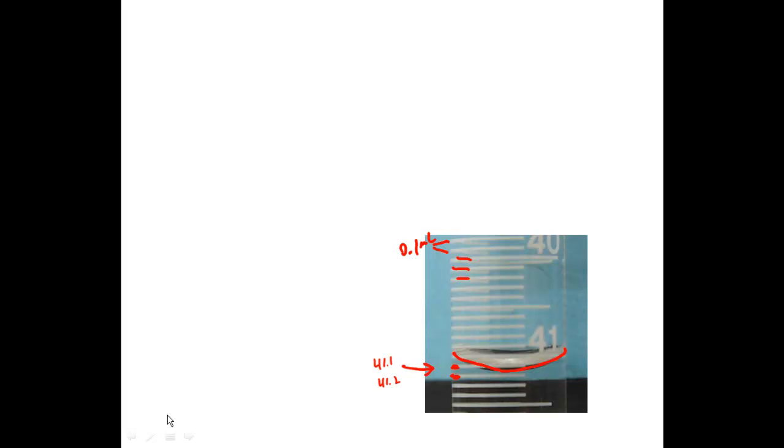I'm certain it's greater than 41.1, and I'm certain it's less than 41.2. So now I'm going to guess at that hundredths place. Looking at this one, I guess that's about 41.18 milliliters.